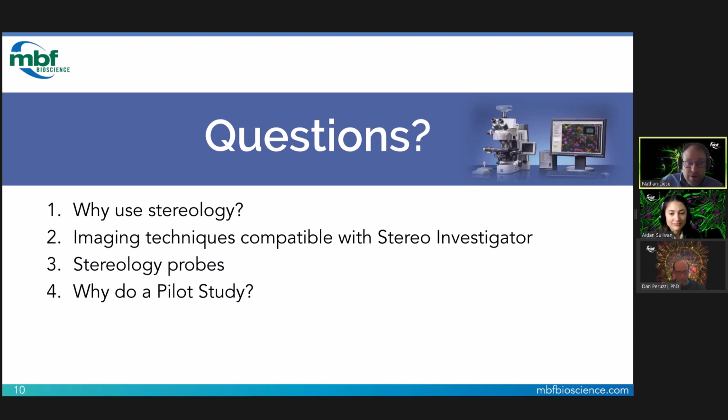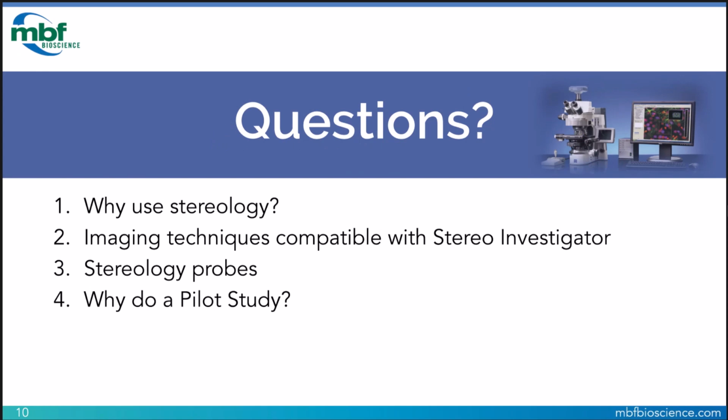Why might you need or want to use stereology? Different imaging techniques that are compatible with Stereo Investigator. We touched on some different stereological probes and reasons to do a pilot study. All right, so again, we'll pause for questions. Doesn't look like we have any questions right now. We will have more opportunity for that, so we'll go back into it.